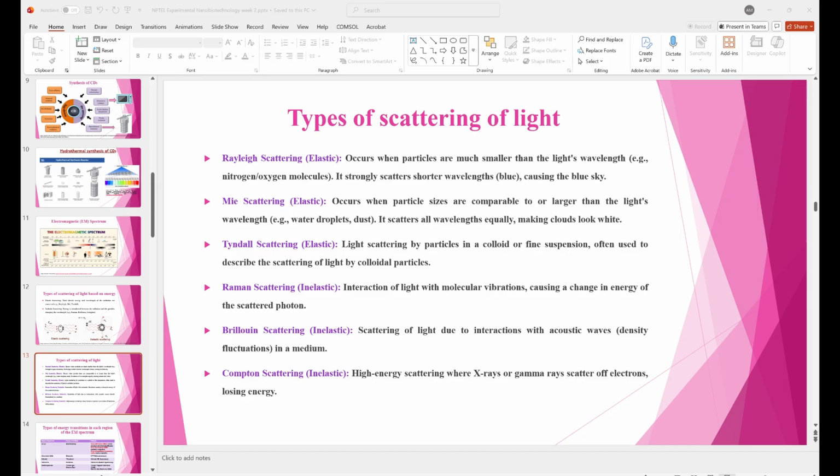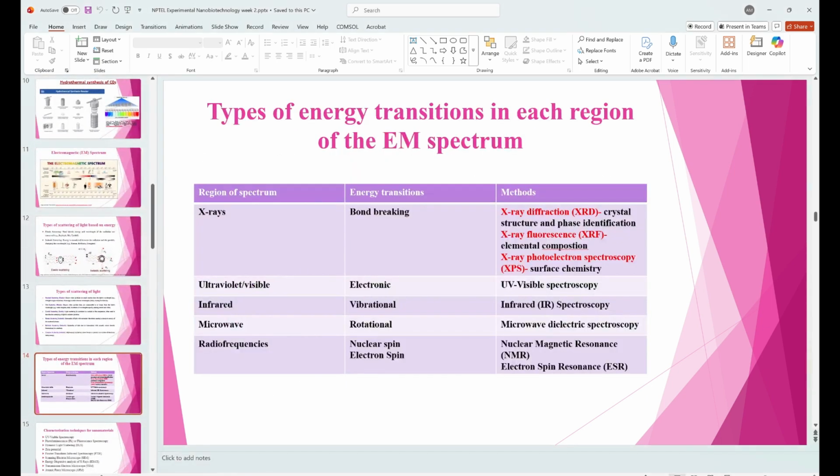So I'll give you an example. I think this example was given in the slide for XRD only, that you were shown an XRD peak of graphene oxide and reduced graphene oxide. So you saw a long peak of graphene oxide. Some HKL plane was written. You know what is HKL plane?